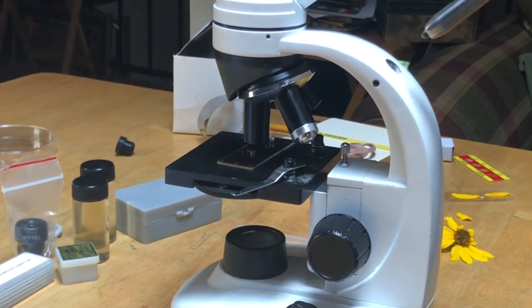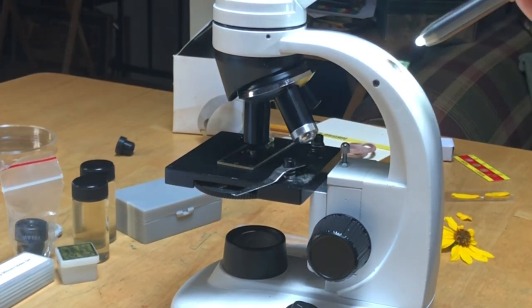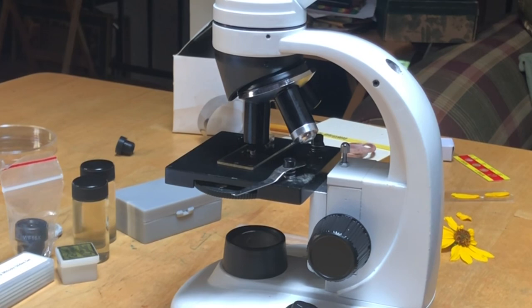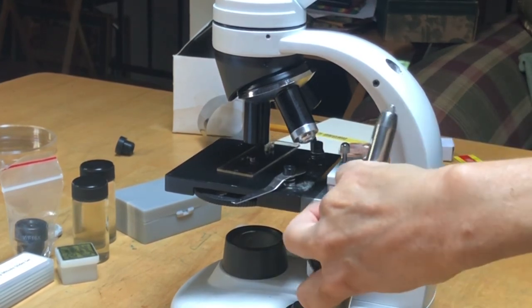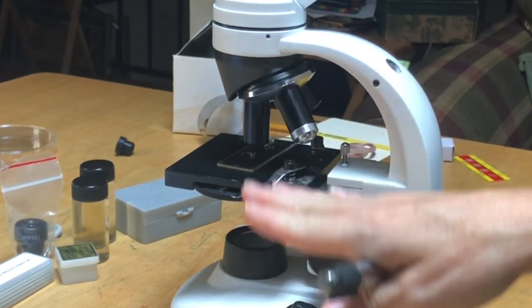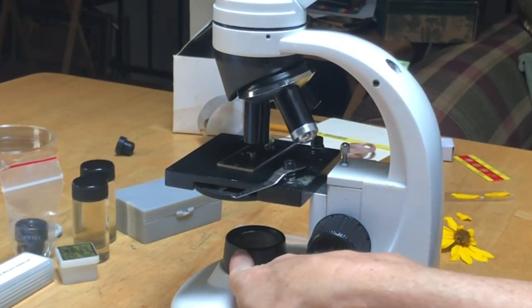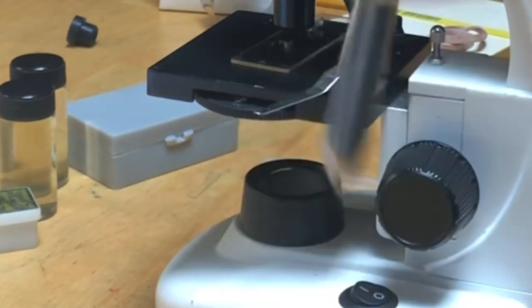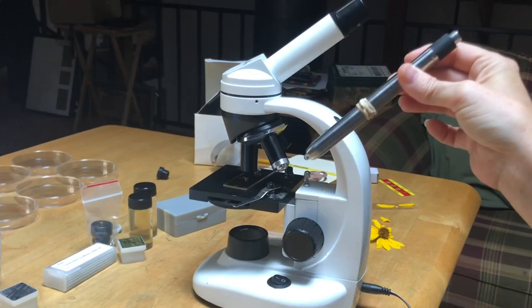But I am going to go over a little bit and share some of the things that we found. So this is the stage. When you are putting things into focus and out of focus, it's the stage that moves up and down to bring things into focus. And this is the bottom light source.